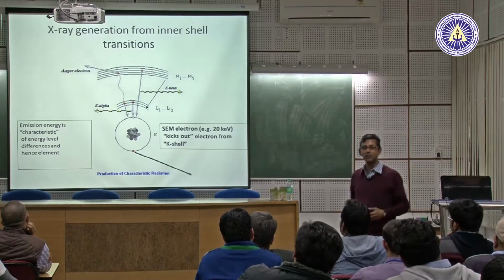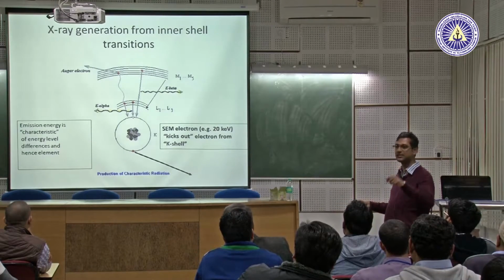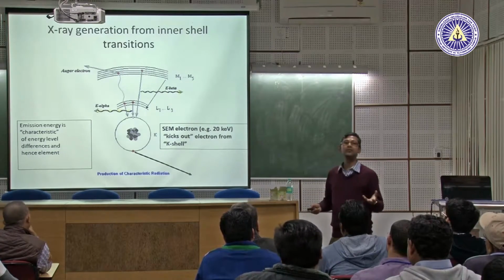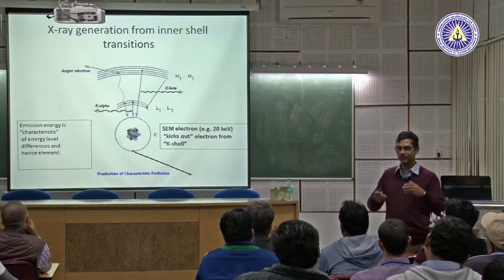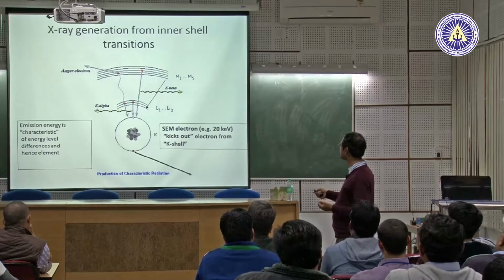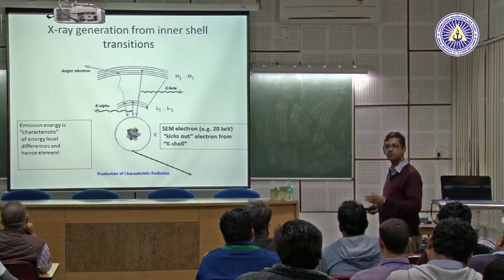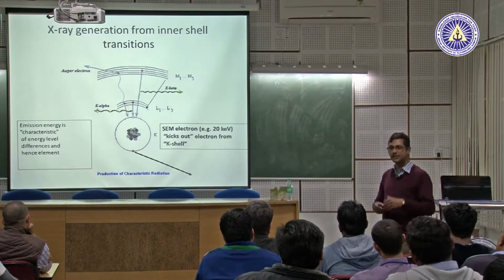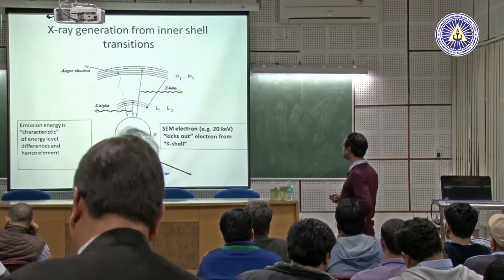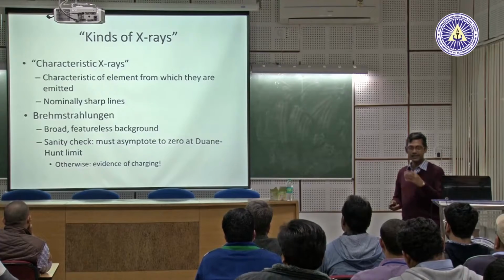I know that every atom has a definite structure, definite levels of electron energies, which are fixed. So simply by measuring this X-ray energy, I can know what element is generating these X-rays. This is very routine stuff, right? Because I know the difference between these energy levels. For example, magnesium: this is not the same for aluminum, silicon, or others. So by knowing the characteristic energy, I can detect the elements. That's the most important thing we do normally.